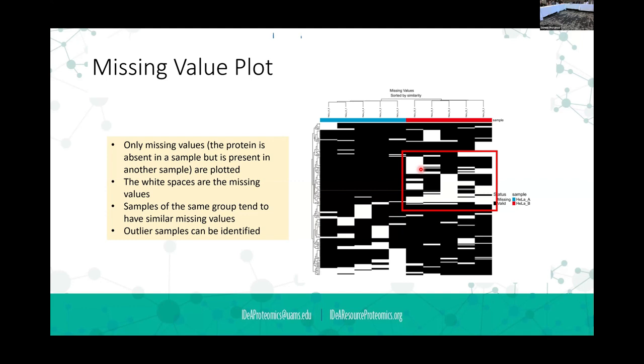But it's a moving target, and it depends on the charge state of the peptide. There are probably about six different factors that come into play, but we don't use a hard and fast rule, like if it's below this level, we're not going to look at it. It's kind of relative. And it is, and it's relative to each instrument as well.